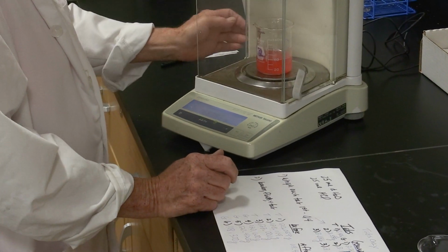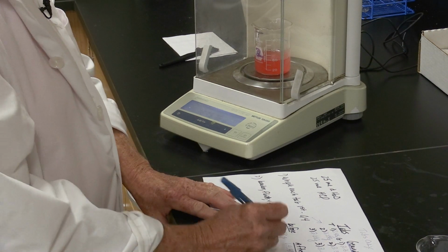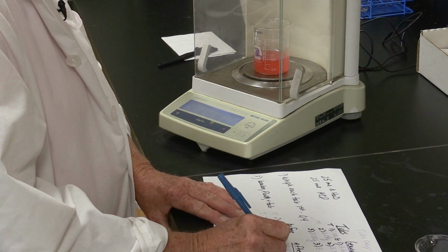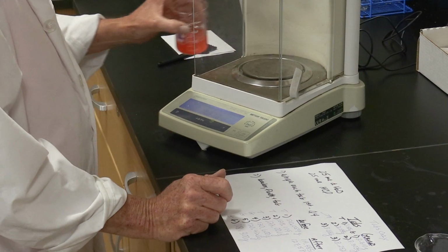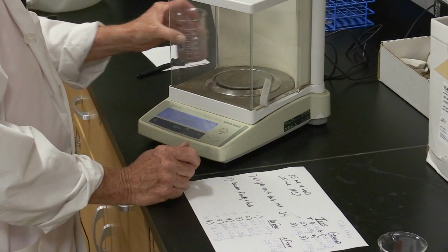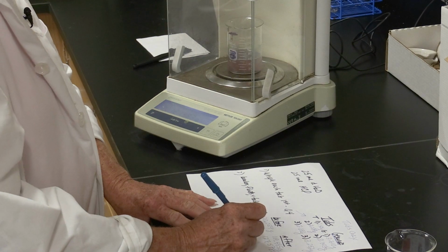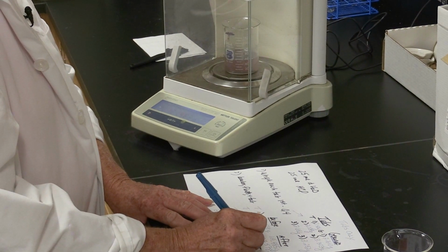Tums 2, 127.578 grams. Tums 3, 121.483 grams.